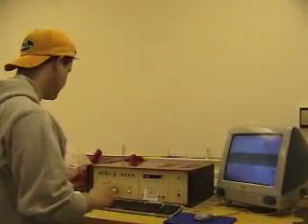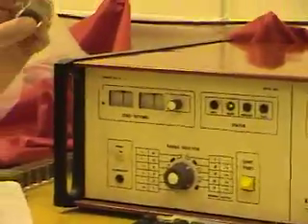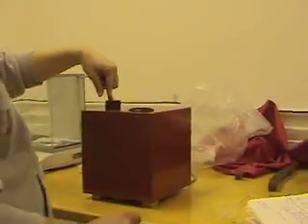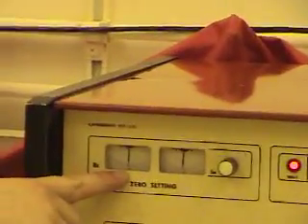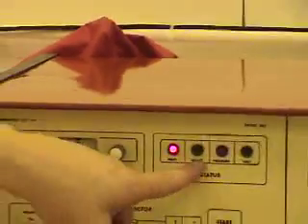And then we need to calibrate the machine. Being that these are sediments, they're pretty weak, so we need to go down to a low range here. We're going to have to calibrate this in 2 different places. One is right here. This is IM, and the other one is on top of the machine right here. And the one on top of the machine controls the left-hand little graph here. So we're going to tune that to be 0. And the right-hand one controls the right-hand one, so we tune that to be 0 also. Okay. And then we let the machine calibrate itself until it says ready.